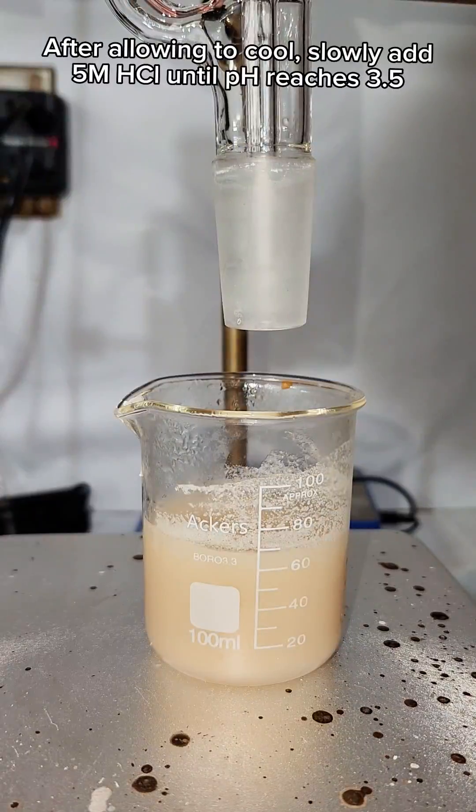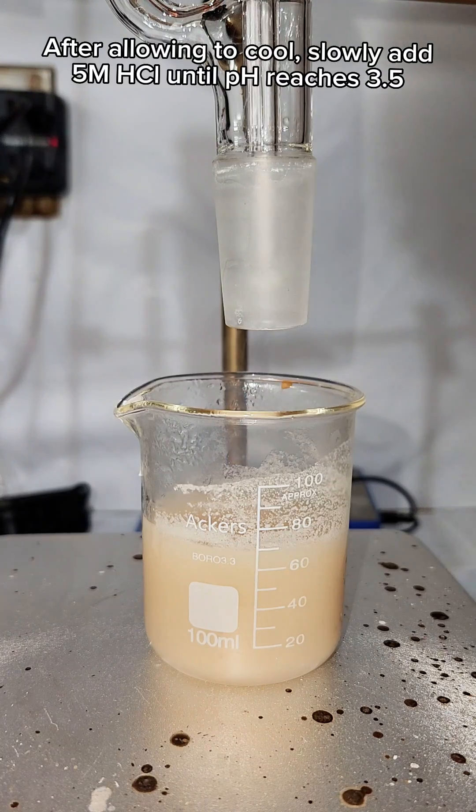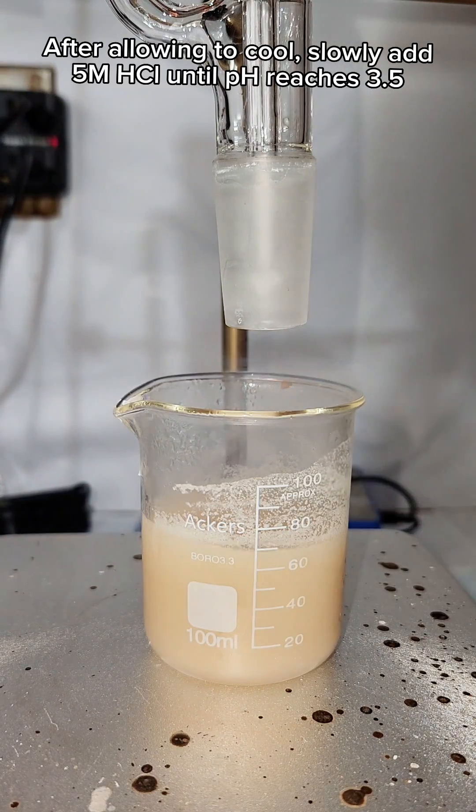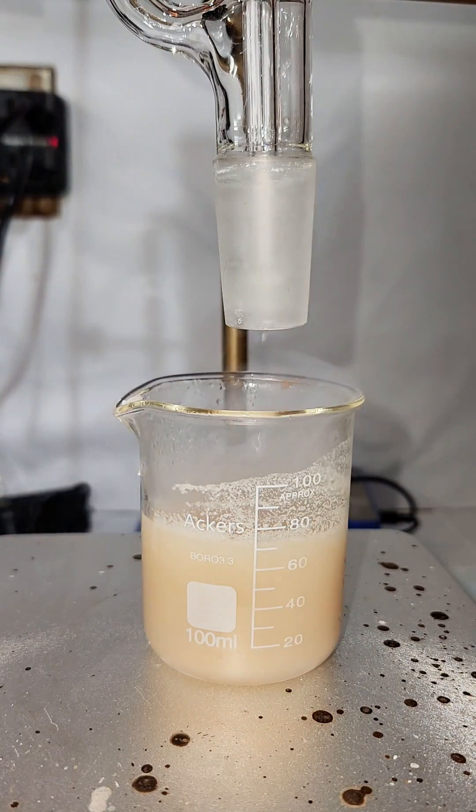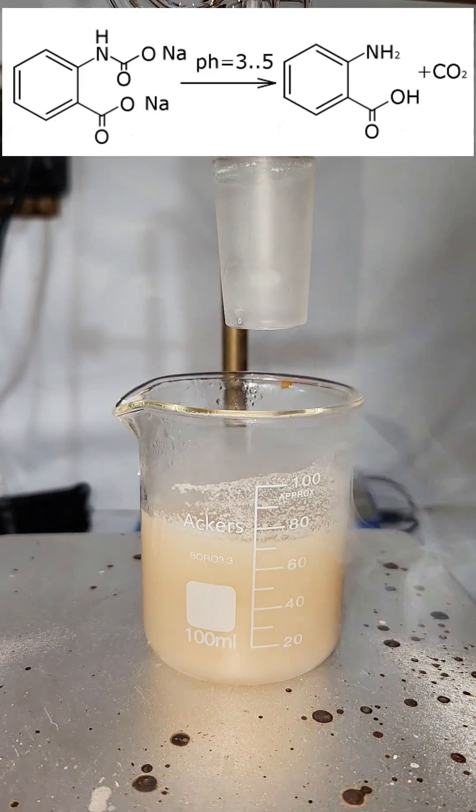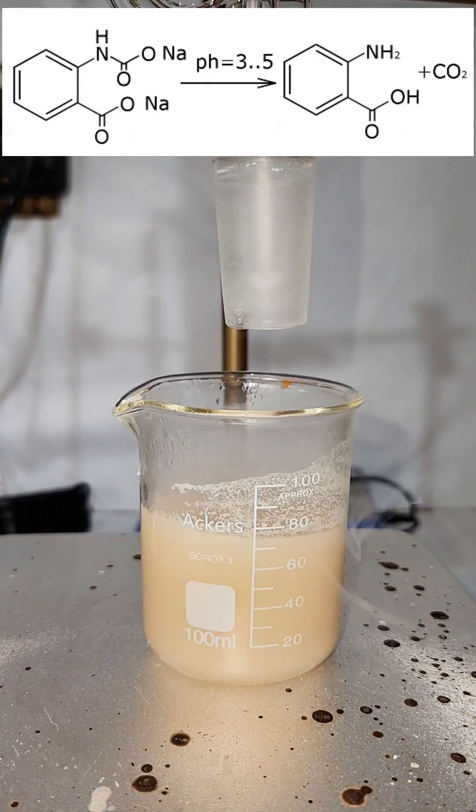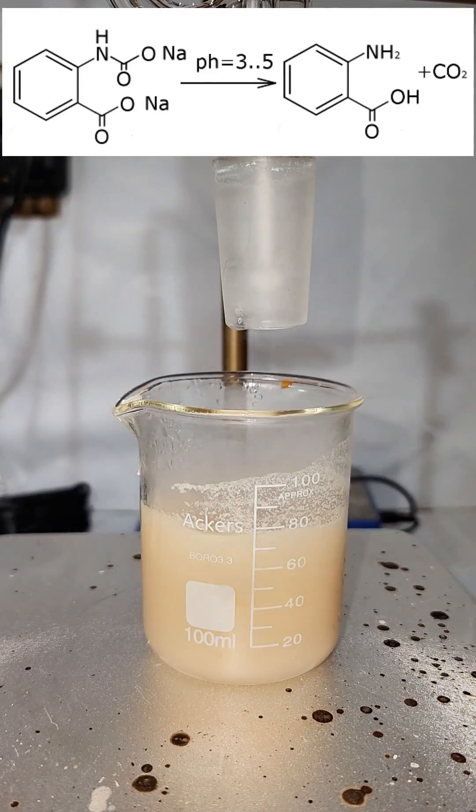For my last step I allow my solution to cool and then slowly add 5 molar hydrochloric acid until my pH reaches 3.5. This step will displace both sodiums bound to my intermediate and produce sodium chloride and CO2 gas as byproducts.